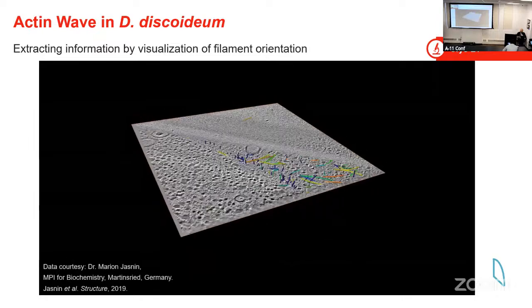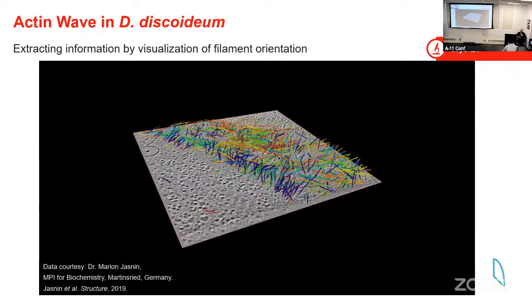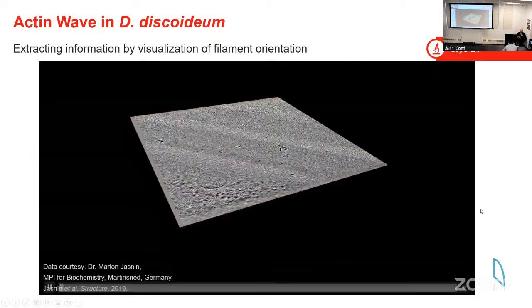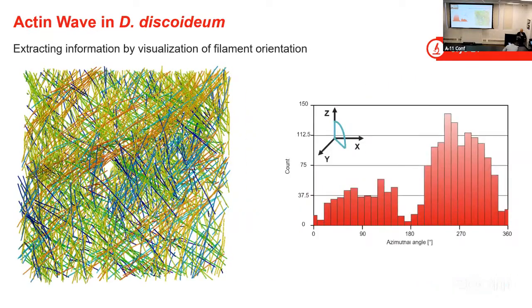I have a question about the auto segmentation of tube functions. I have a very large tube that I've been trying to use AMIRA to auto segment, and essentially it won't let in the dimensions of the tube. Is there a size restriction to how big the tube can be? I hear the first part of the question that you have large tube structures in your images.